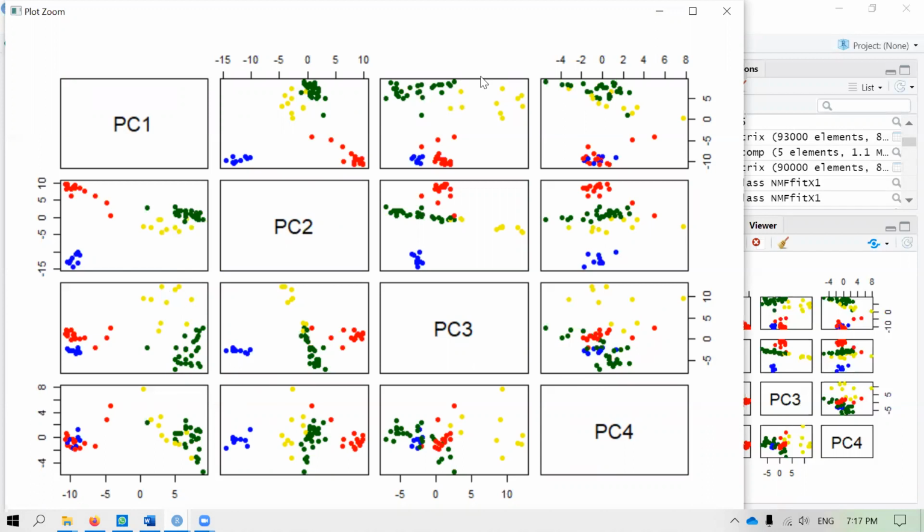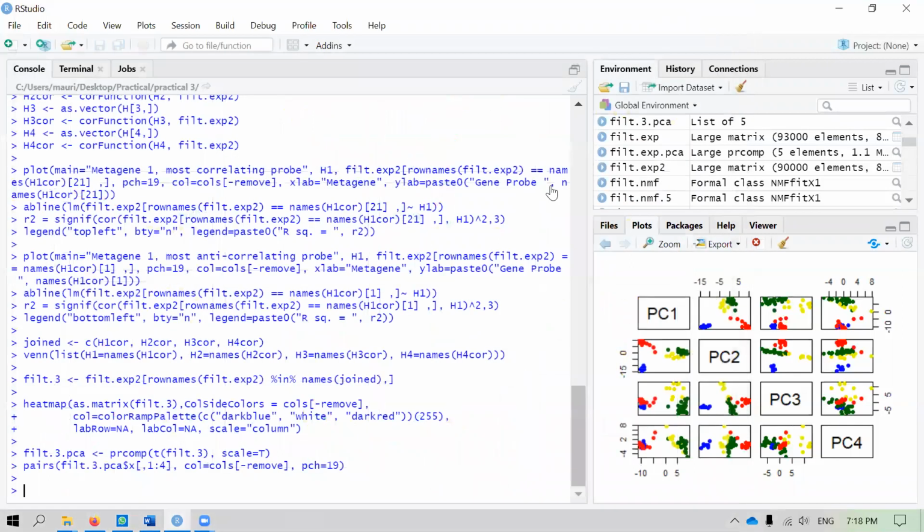We are getting some sense that these 4 tumor subtypes may be separable. This is very important. If everything is jumbled up in a big mess, then it tells us that maybe things are not separable. Now it tells us that things may be separable. Why not we try to build a classifier and see what happens? Because at the end of it, when we test our classifier, it will really tell us whether we are doing a good job. So let's continue moving on at this stage.